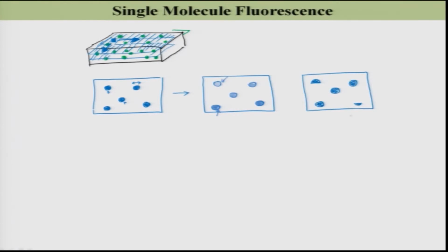So, what is the reason for this? Because you are going to scan your laser throughout this matrix. Let me change the color quickly. You are scanning like this, going from here to here, coming like this and then like this and then like this. Like this you are scanning and creating this image, starting from here, here and then like this.